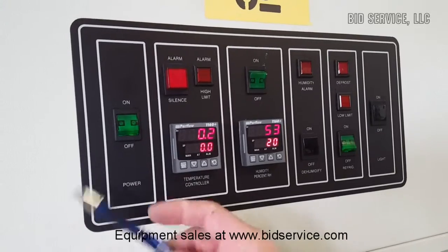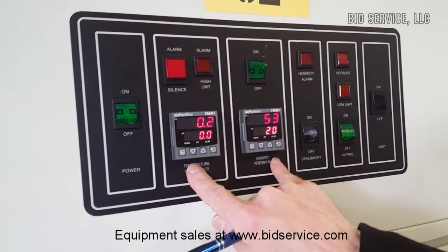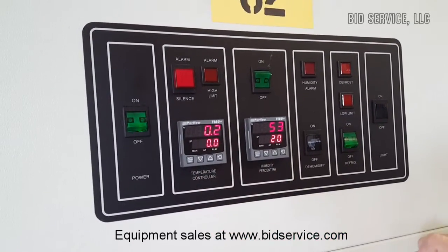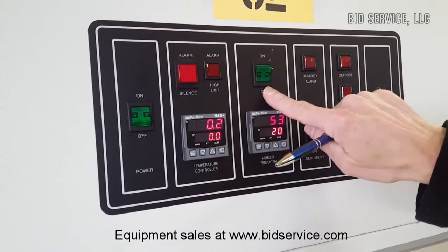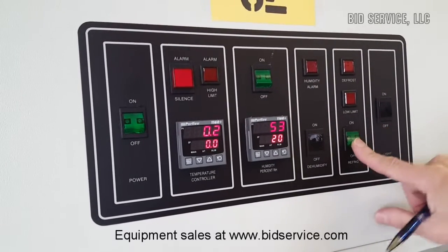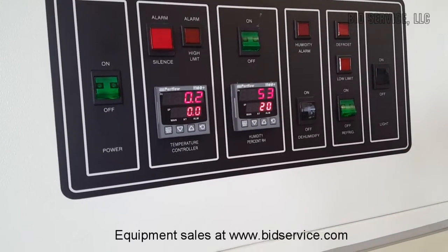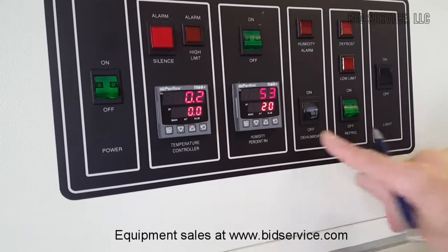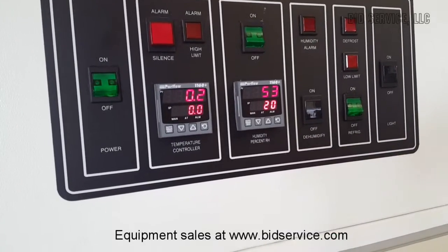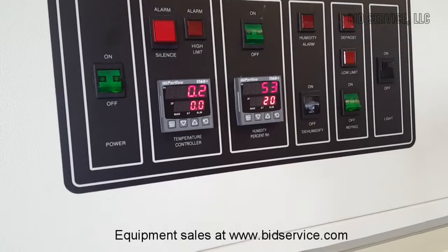Going back to the control panel here — here's your on and off switch. That will turn on your two controllers here, your part low controllers. If you want to turn the humidity on, here's your on switch for humidity. Your refrigerator on and off — that will turn the compressor on or off. There is no light and there is no humidity option, and there's no defrost option on here either.